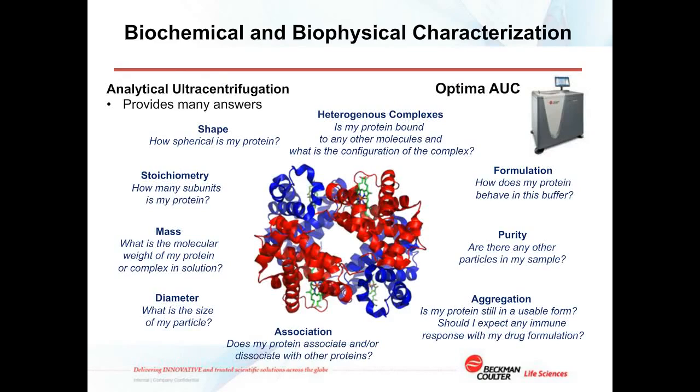So finally, I show analytical ultracentrifugation. This tool is extremely rigorous.